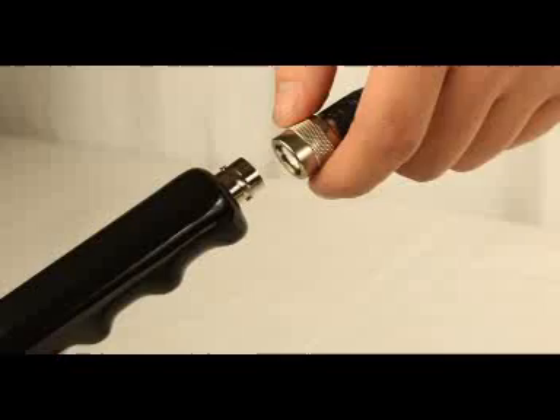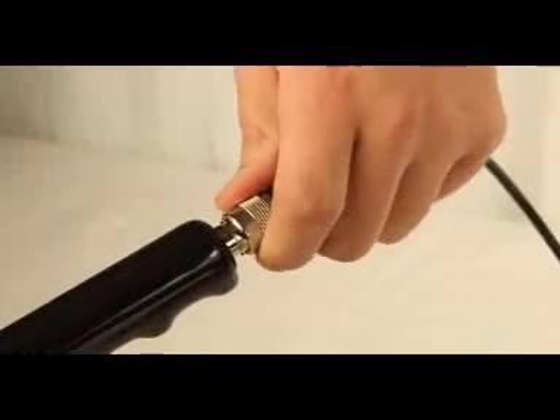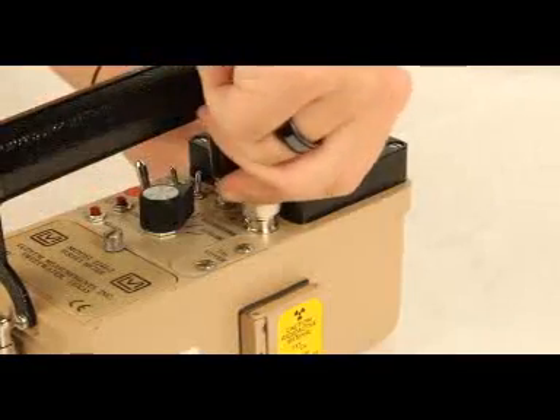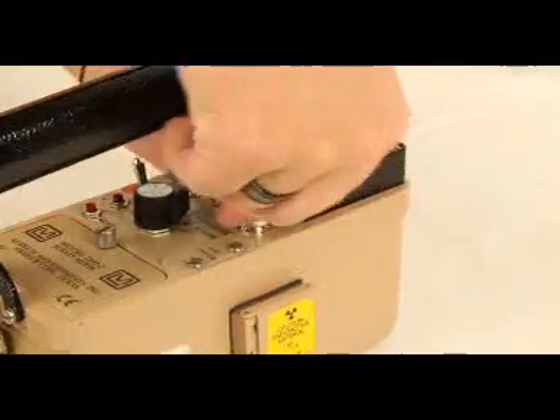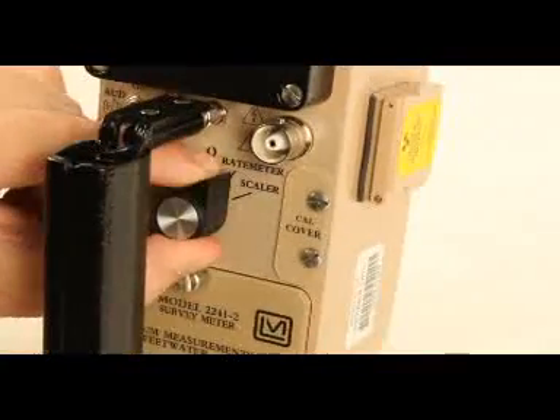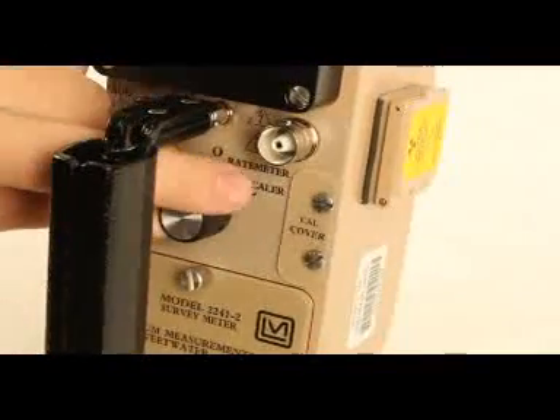To attach the probe to the meter, connect one end of the cable to the probe and tighten by turning the connection clockwise. Repeat with the other end of the cable to connect to the meter. Before using the probe, check to ensure the cable is connected correctly. Make sure that the unit is in the off position while connecting the cable.